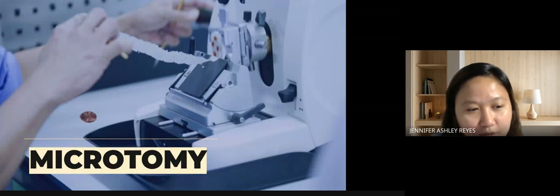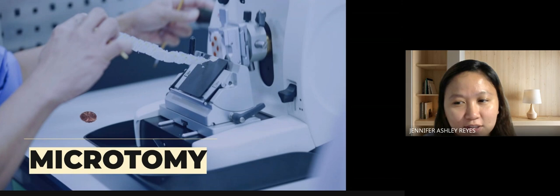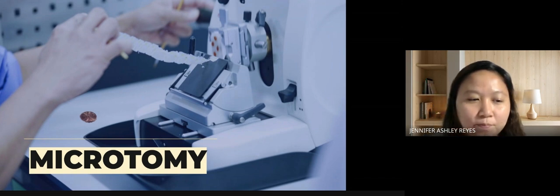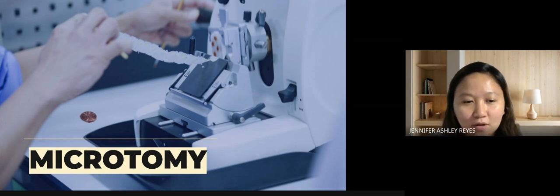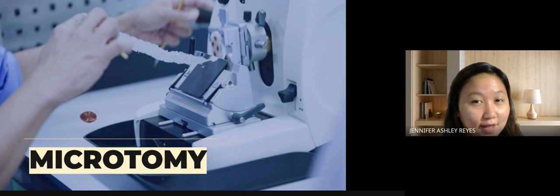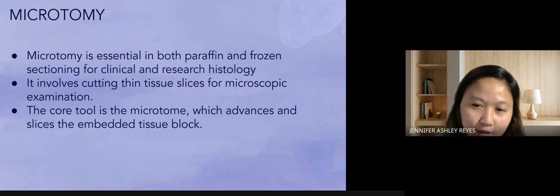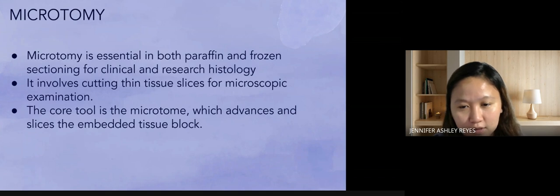So, what is microtomy? Think of it like culinary artistry in which instead of cutting or julienning carrots, you are actually slicing biological tissues into micron-thin ribbons that even ants will trip on. So microtomy is essential in both paraffin and frozen sectioning, for clinical and research histology.